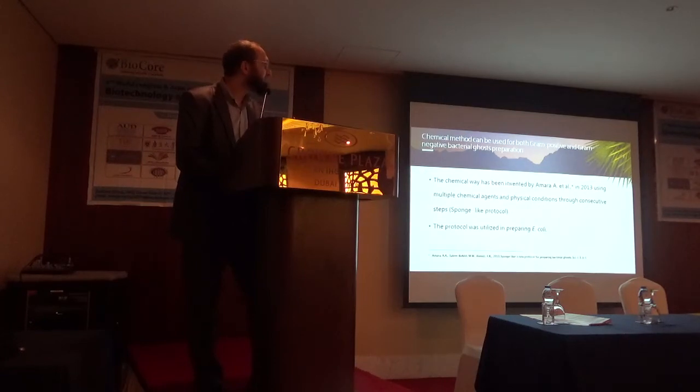The chemical way was invented by another scholar called Amara in 2013, using multiple chemical agents and some controlled physical conditions through consecutive steps. This protocol was utilized in preparing Escherichia coli, which we know is gram-negative.